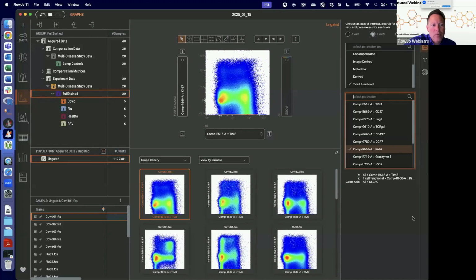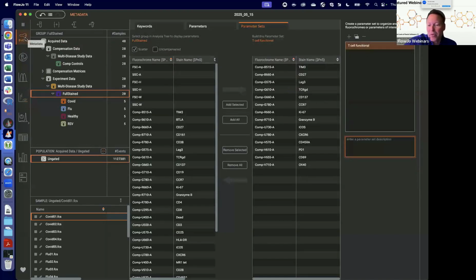There's a lot of things that just are in 11 that aren't in 10 and vice versa at this point. We figured that would be something that would be better served waiting till we had some more overlapping functionality. Okay, so we looked at the first step, metadata, and I'm at 10:20, so I better get moving.